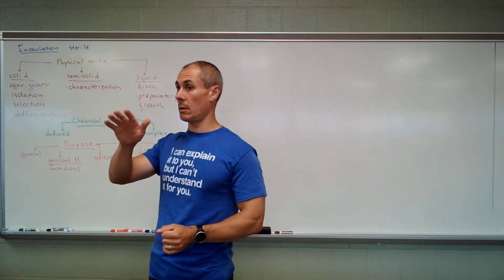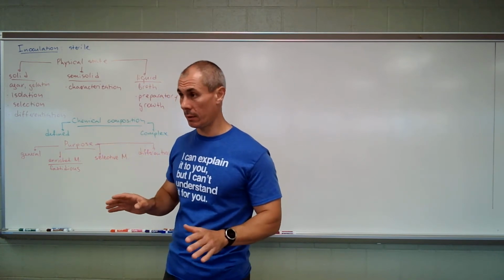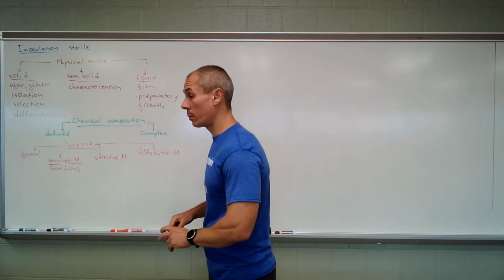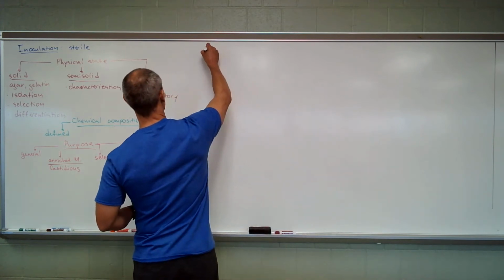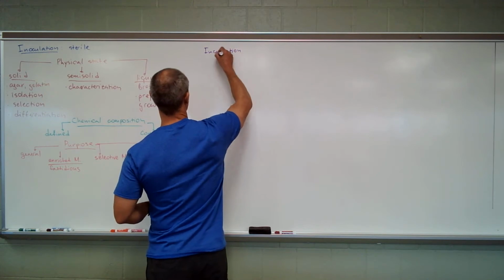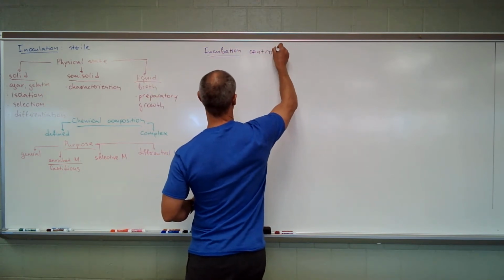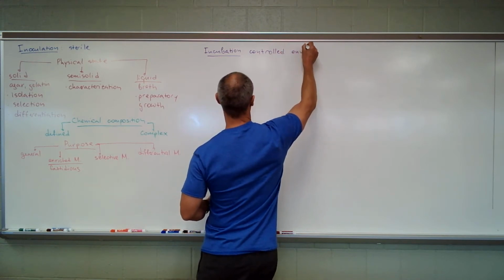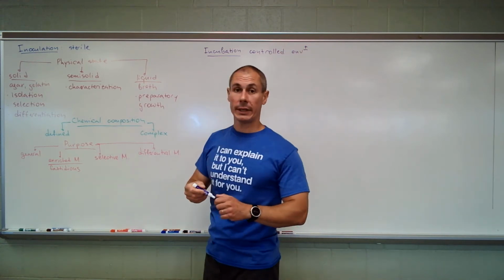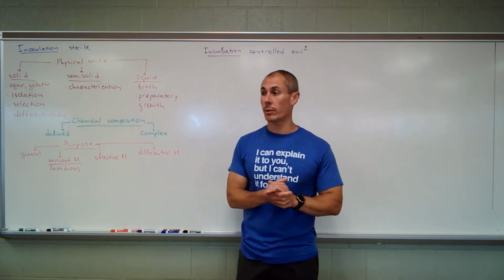Inoculation and identification, incubation, identification, I'm going to briefly go over. So, incubation, what's the goal? Controlled environment, that's all. Often the idea is, oh, we need to incubate microorganisms at 37 because they don't grow at room temperature.